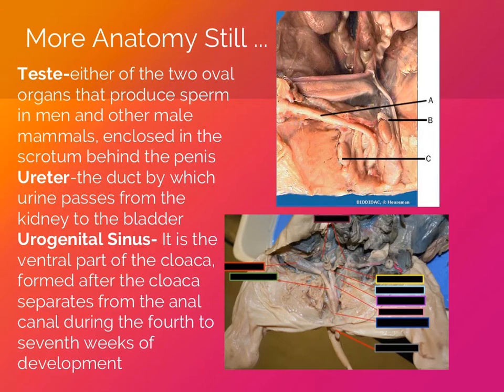In this picture, you can also see the male penis, not to be confused with the urethra, which is lying behind it. The female structure, the urethra coming off of the bladder and the vagina coming off of the uterus, combine together to form the urogenital sinus. That's at the posterior end of the body, and that's unique to the pig compared to humans. Humans have two openings, one for each the vagina and the urethra, but the pigs have just one opening.